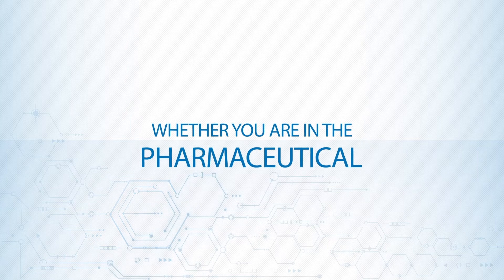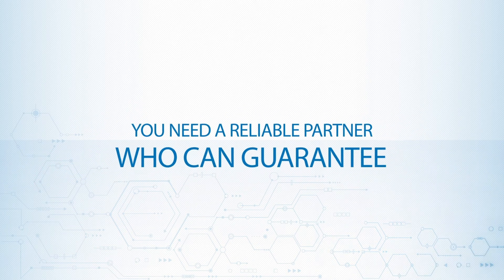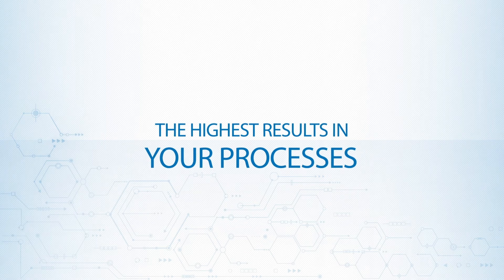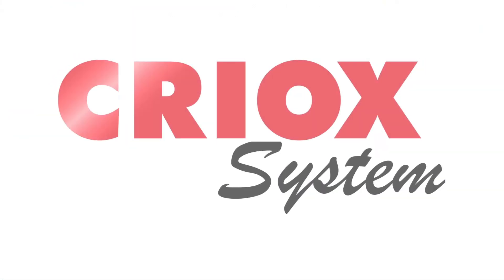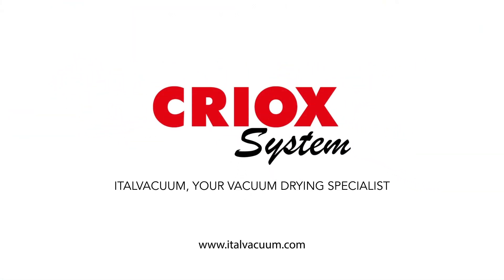Whether you're in the pharmaceutical or fine chemical industry, you need a reliable partner who can guarantee the highest results in your processes. The CRIOX system from Italvacuum — your vacuum drying specialist.